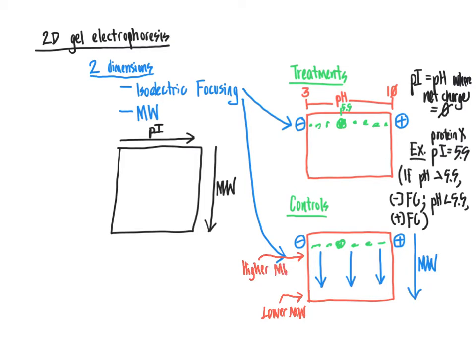This would be true for both the treatments and the controls: in that second dimension, they're separated by molecular weight.